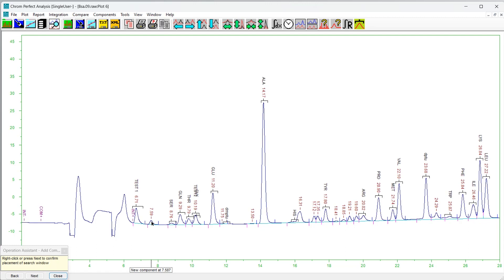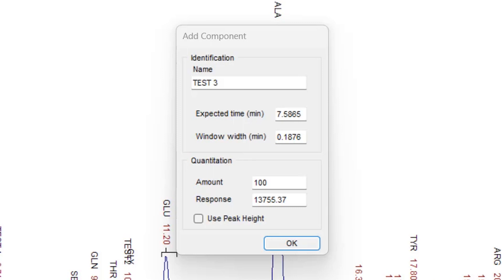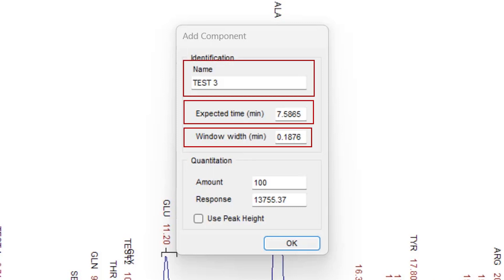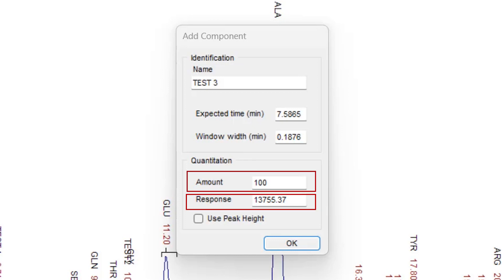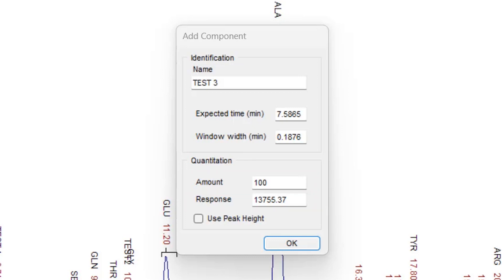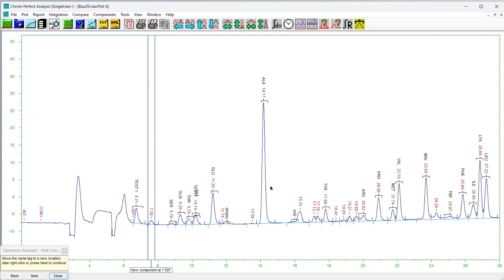To confirm the action, either press the Next button on the operation assistant or right-click on the chromatogram plot. The following form will appear. Enter the new component name and alter the expected time or window width as desired. The new component will be created with a single data point at level one. Enter the amount and response values. The response value is not critical if the calibration file will soon be updated with one or more bound files. If the peak is to be quantified by height, check the Use Peak Height checkbox; if by area, leave it unchecked. When finished, press OK.